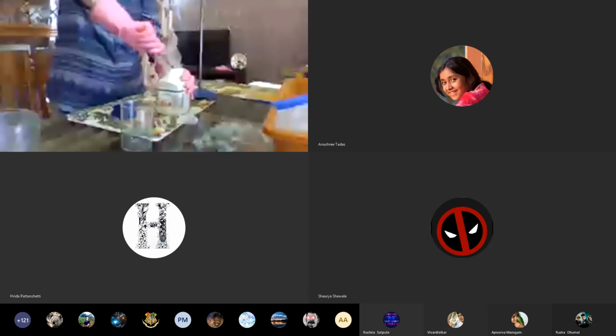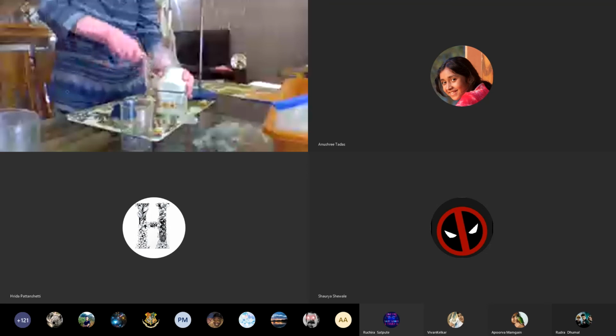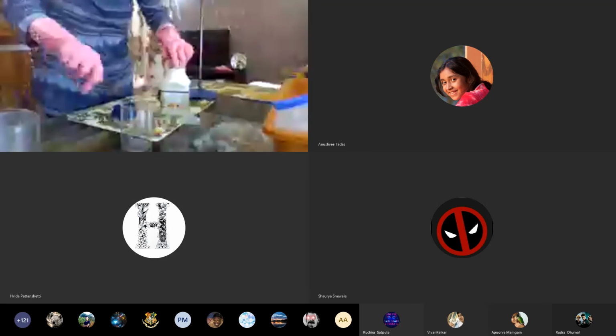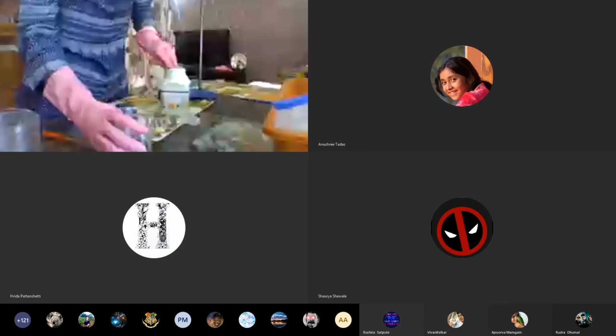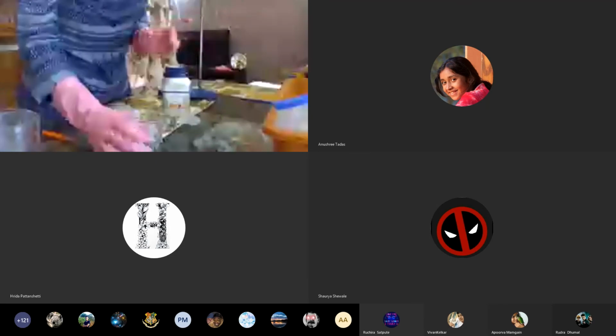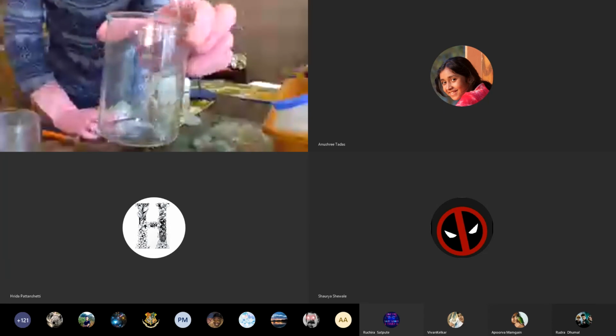My goodness. Let me show you the sodium. It is very bright. Now, can you see this sodium?